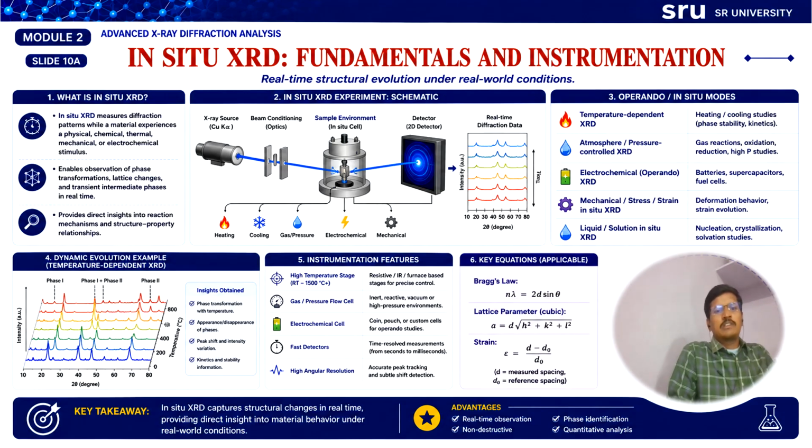The peak simultaneously decreased with increasing temperature. At the same time, some other peaks near 80 degrees were introduced at high temperatures. It means crystallization and phase transformation take place during the heating process.